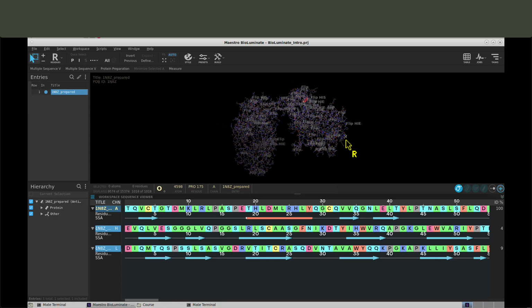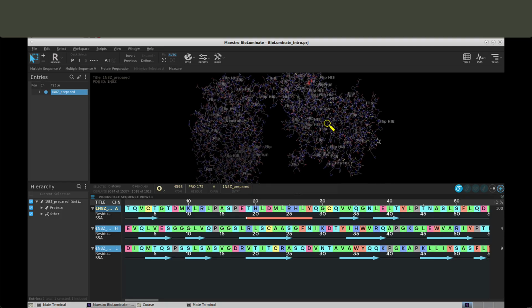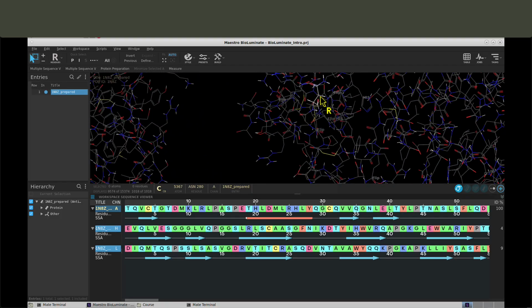Finally, let's zoom in a bit to see the individual residues of the structure more clearly. Use your left mouse button to click on some part of your structure. This will select the particular residue that your mouse clicked, and you should notice that all the atoms in the residue are highlighted in blue. Also notice that residues under your mouse will highlight as you hover over them. Use this predictive highlighting to help you know what you're going to click on before you click on it. This is especially useful when you have a crowded workspace.